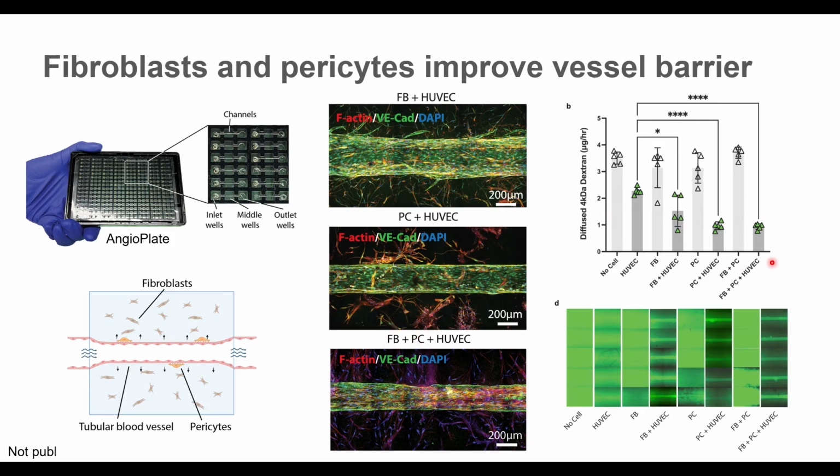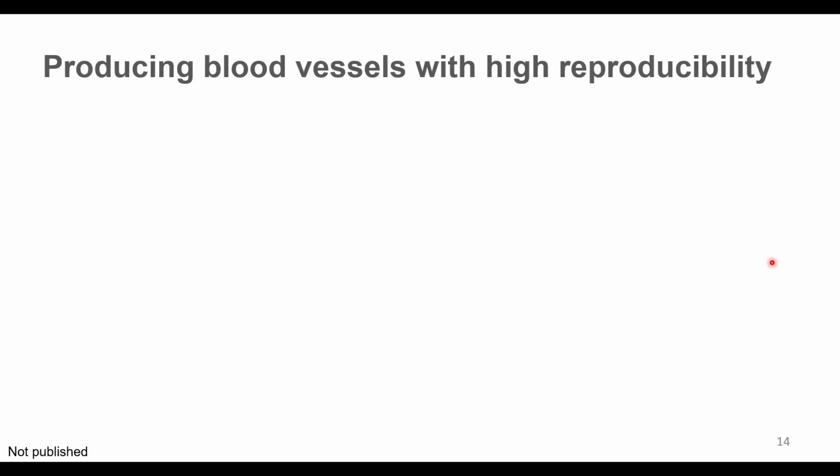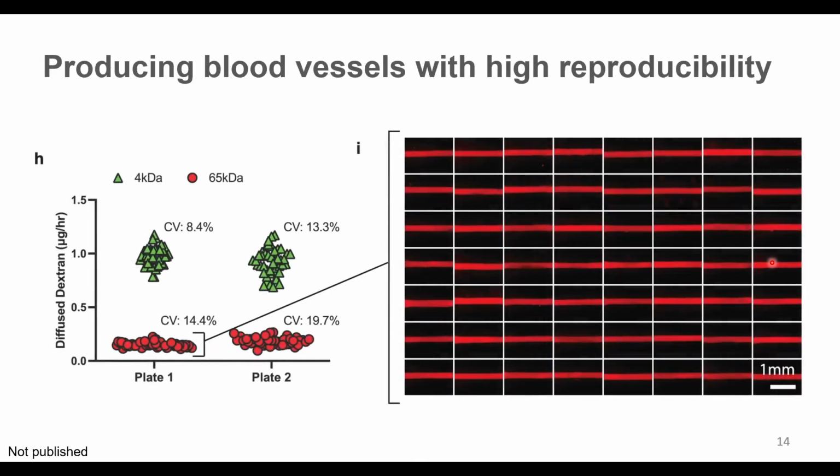Okay. Now, one key advantage of this model system is that before, when we were using the iFlow plate with the self-assembled vasculature, if we had 10 million endothelial cells, we could maybe cast a column of tissues, about 16 tissues. But now, because we have a simplified structure, with 10 million endothelial cells we can pretty much seed an entire plate of tissues. So that's over 100 tissues.